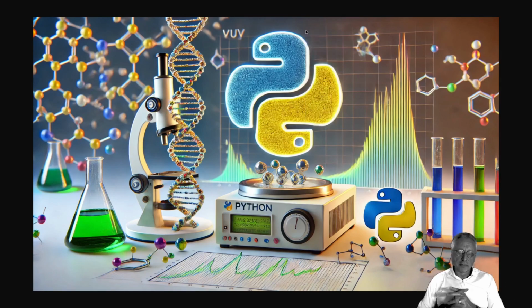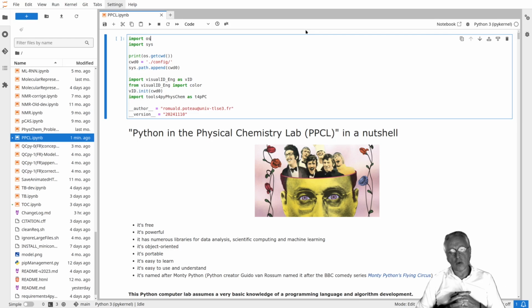I'm now going to explain what is the content of a PPCL notebook, so Python in the physical chemistry lab in a nutshell notebook. So let's move to this notebook. I am still in my web browser. I already have opened a Jupyter Lab session. This is the PPCL notebook.